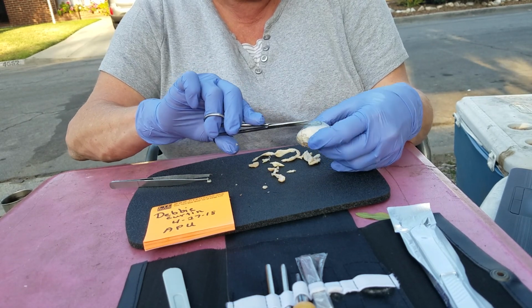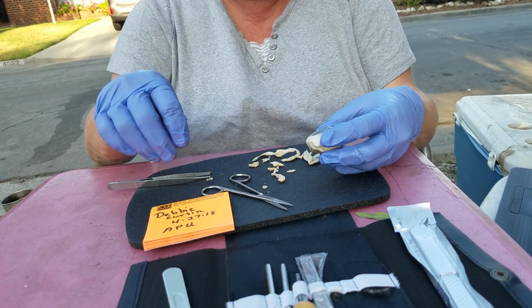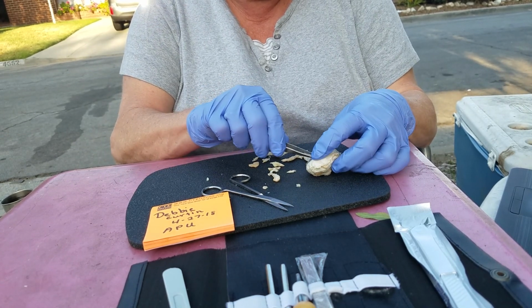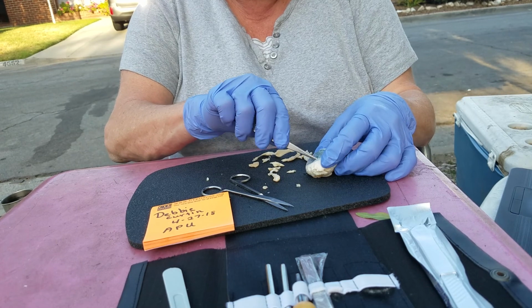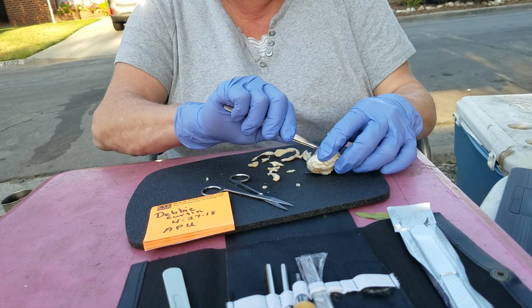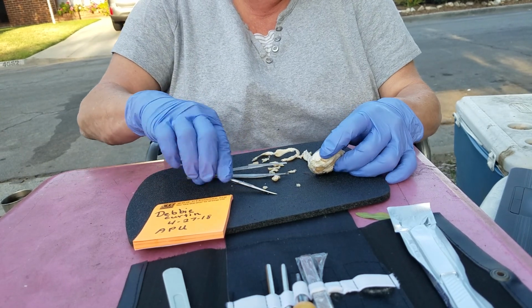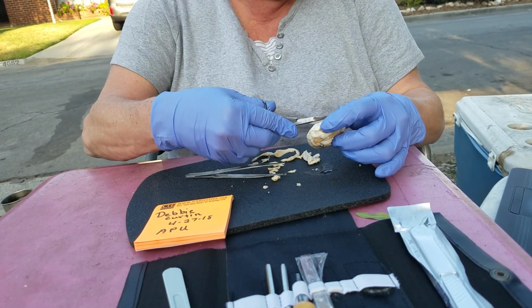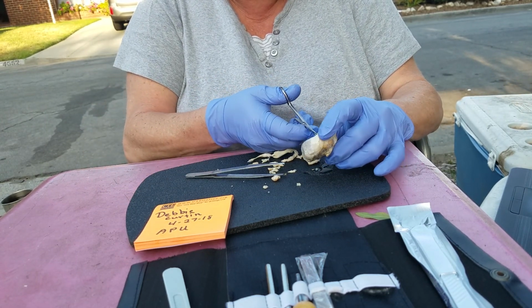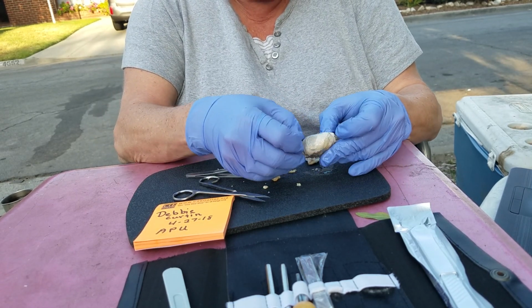I have incised the eye. Now there's a little bit of clear fluid leaking from the eye. Now that it's incised, I'm going to use my forceps to separate so we can look inside of there. It's pretty tough tissue. I'm going to extend the incision so I can get a better view here. And I'm going to extend it both ways. There we go. And now you can actually take a look.